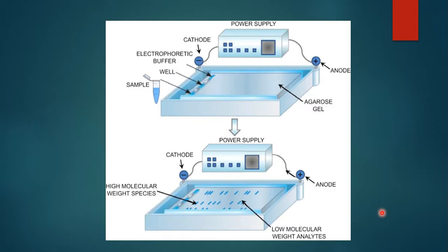So then coming to the next, this is a chamber of the electrophoresis. If you observe, here is the loading of the sample, the dark blue in color. And here is a well. Well does not mean water. This small notch-like structure we call a well, and in this well you are going to put your sample.